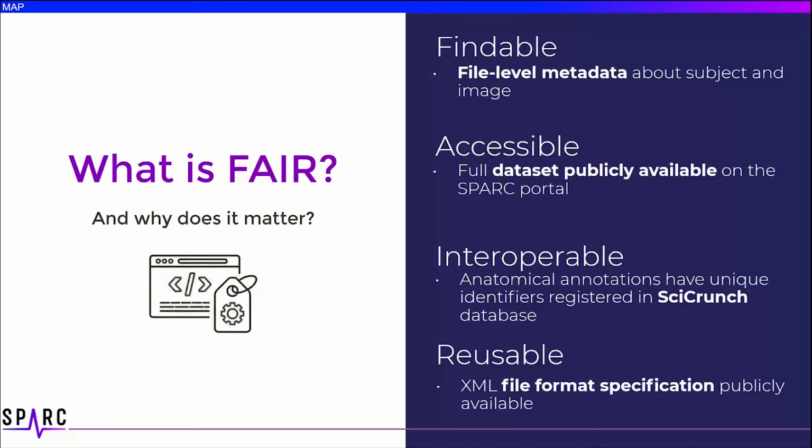The mechanism that we've created works under the hood, so the data you generate in Neurolucida 360 has the necessary FAIR aspects with little effort on your part. These FAIR aspects include metadata about your sample and the structure models that you've created with Neurolucida 360's toolset. The metadata allows the morphological models to be interpreted at the file level independent of you.